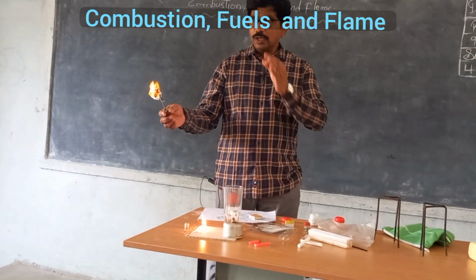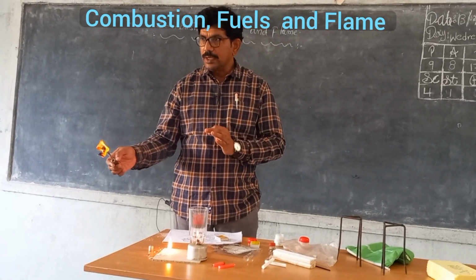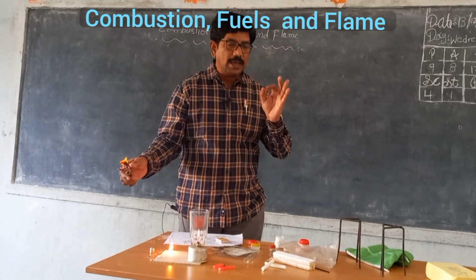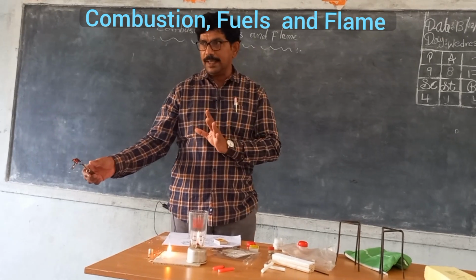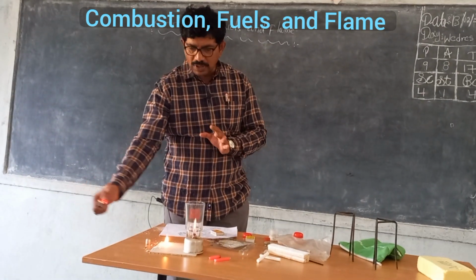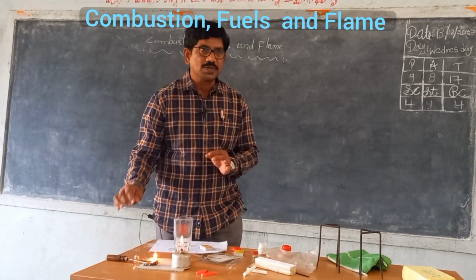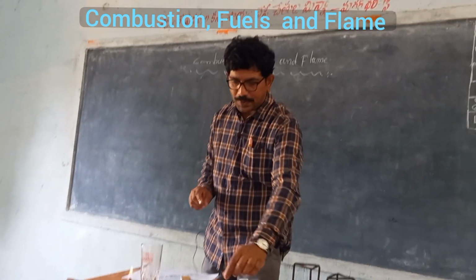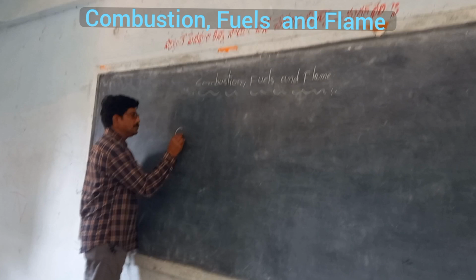So, with this experiment, what we observed is, when a few substances or materials are brought near the flame, they catch the flame and they burn. So the process of burning any substance in the presence of air is known as, what we call it, combustion. So what is meant by combustion?